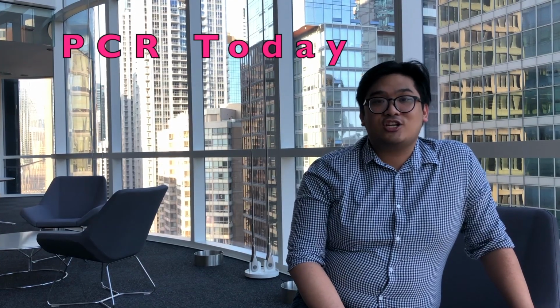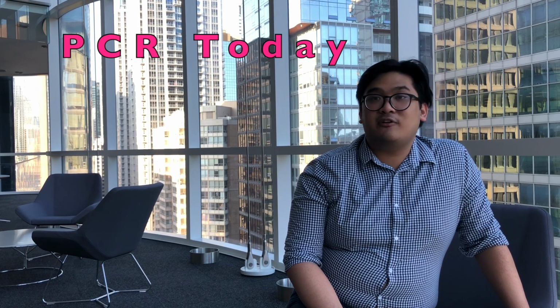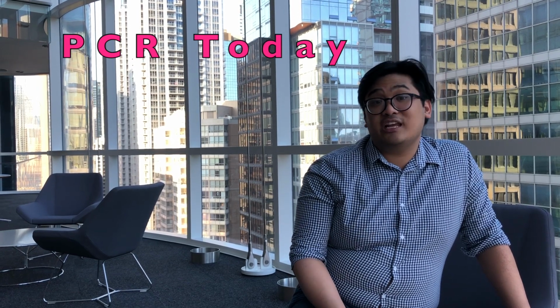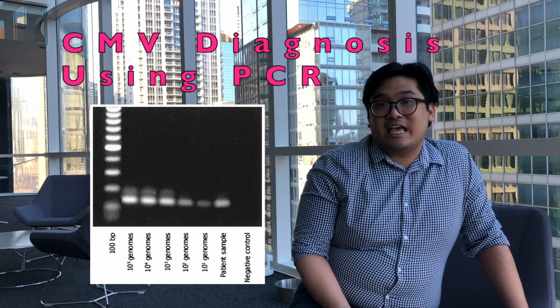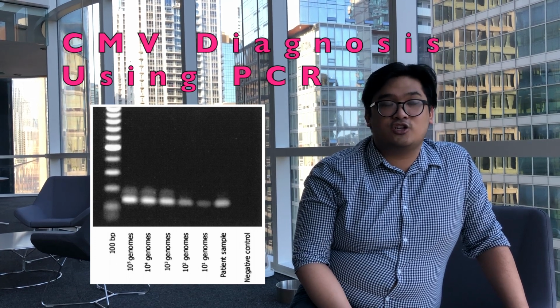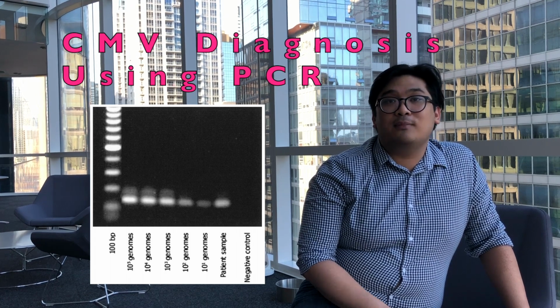So the polymerase chain reaction is important for cloning and molecular diagnostics. PCR can amplify a region of interest, which can be inserted into a vector with different promoters for bacterial transformation protocols. It also serves an important role in pathogen discovery. For example, in a review by Gelder, PCR can serve as a tool to diagnose CMV infection, where other laboratory techniques had difficulty before.